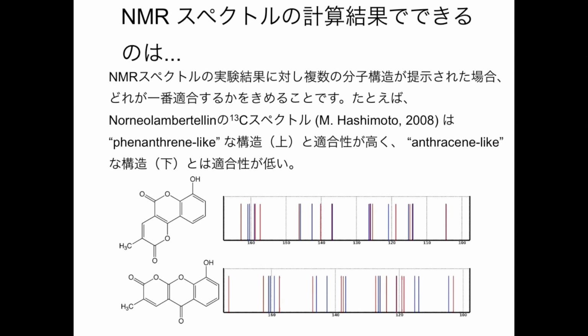If you want to try to decide, you simply look at the comparison. You'll see that this one is actually pretty good, and this one is terrible. There's a line out here which is completely on its lonesome, whereas that is pretty good. I think the error here is something like 1.8 ppm. This one's something like 5. So here is an application where we can actually say something is reasonable or something is not reasonable. Okay.